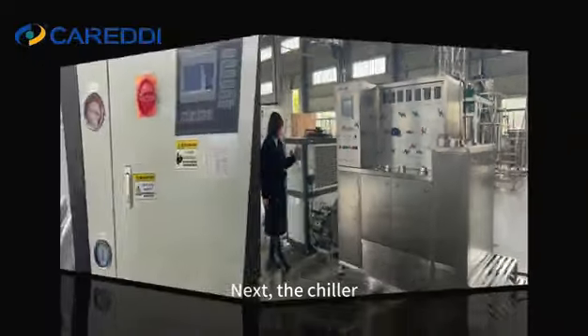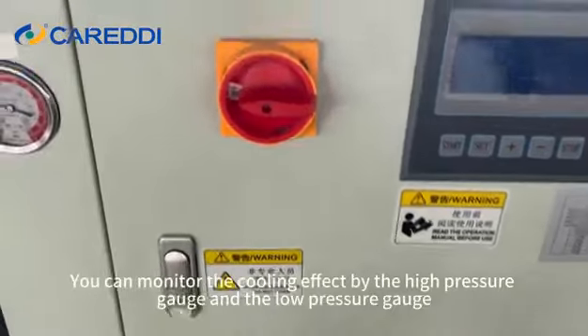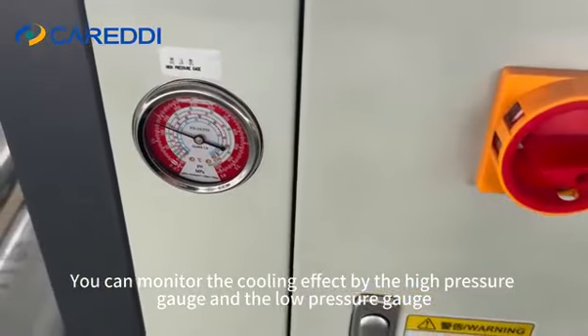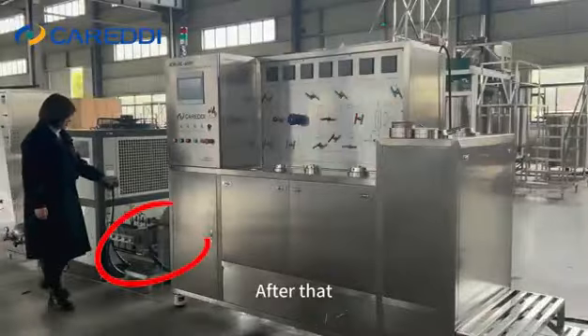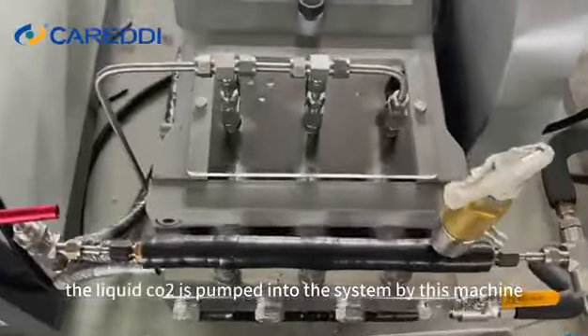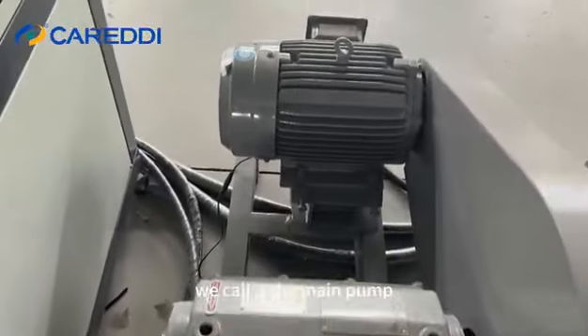Next is the chiller. It turns the CO2 from gas to liquid. You can monitor the cooling effect by the high pressure gauge and the low pressure gauge. After that, the liquid CO2 is pumped into the system by this machine — we call it the main pump.